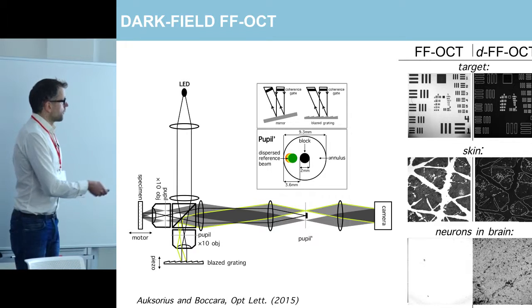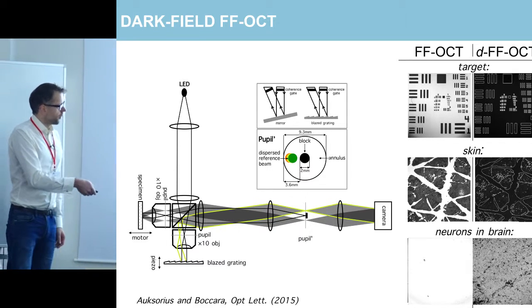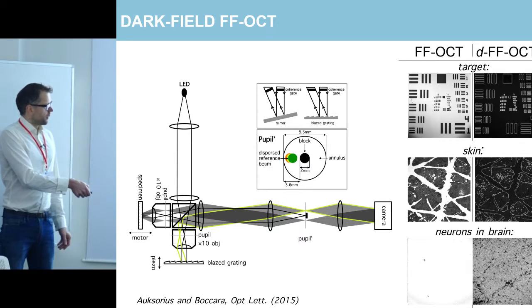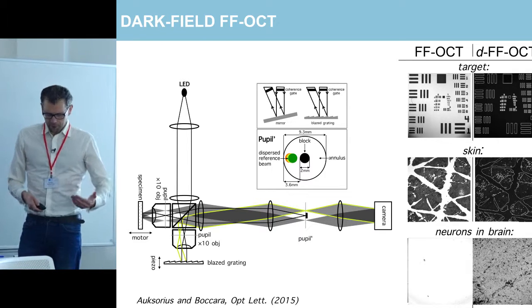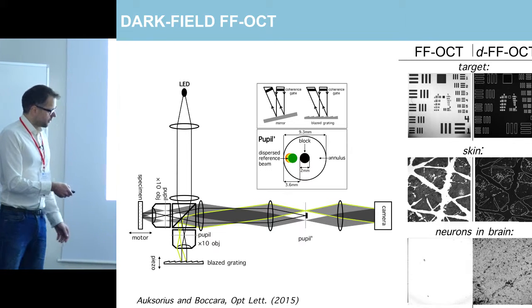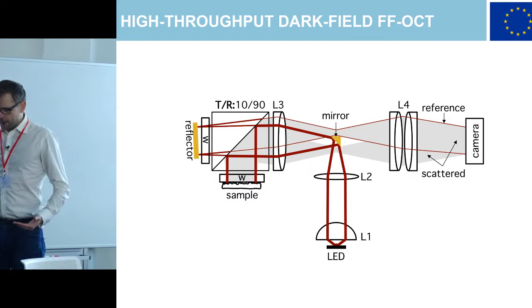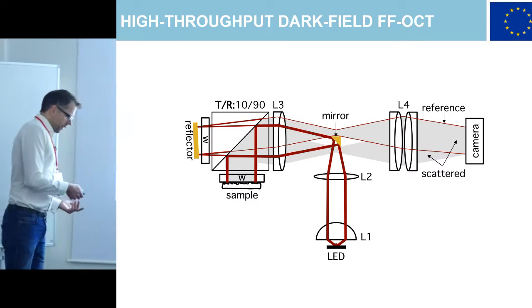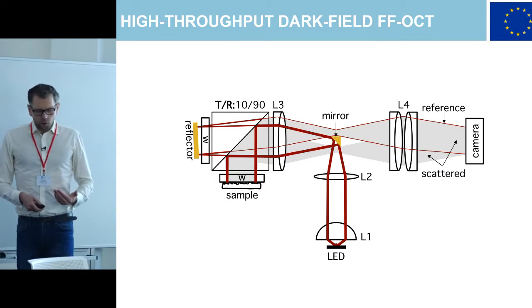And just a demonstration that surface images might look a little bit odd, but if you go deeper in tissue, you see there's no difference. The only difference is that you see the first slide in regular imaging. It is basically saturated. However, we started running out of LED power. We used the most powerful LED we could, but we couldn't operate the equipment in an optimal regime.